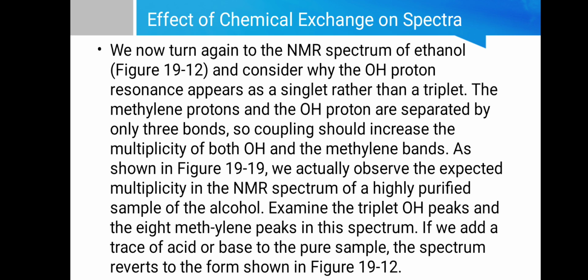Effects of chemical exchange on the spectra. We now turn again to the NMR spectrum of ethanol and consider why the OH proton resonance appears as a singlet rather than a triplet. The methylene protons and the OH protons are separated by only 3 bonds, so coupling should increase the multiplicity of both the OH and the methylene bands. As shown in the figure, we actually observe the expected multiplicity in the NMR spectrum of a highly purified sample of the alcohol. Examine the triplet OH peaks and the 8 methylene peaks in the spectrum.